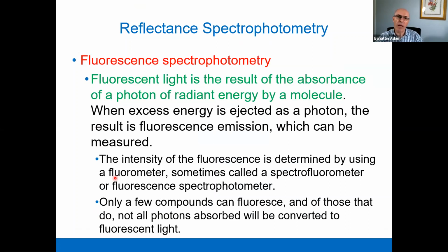Okay, we also have fluorescence spectrophotometry, which is also a kind of reflectance spectrophotometer. Fluorescent light is the result of the absorbance of a photon of radiant energy by a molecule.